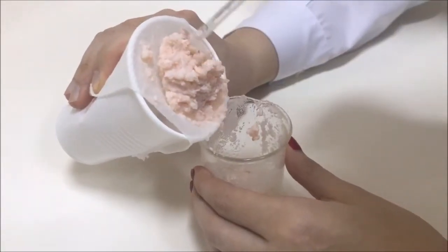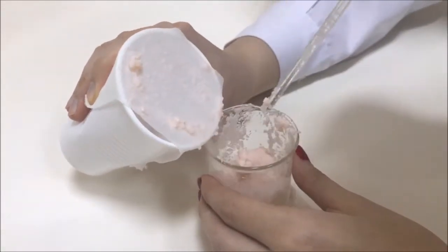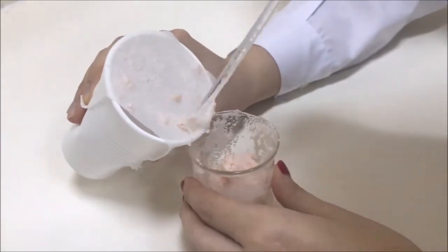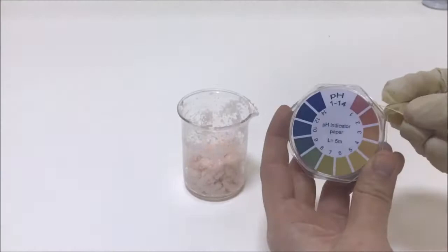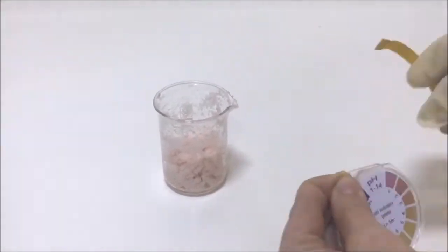Place the solid soap back into the beaker using the stirring rod. Measure the pH of the soap with new pH paper.